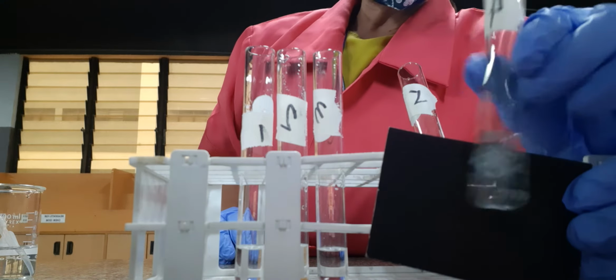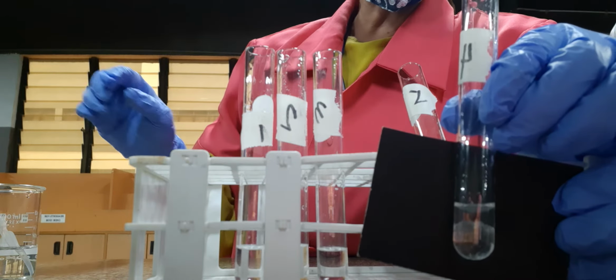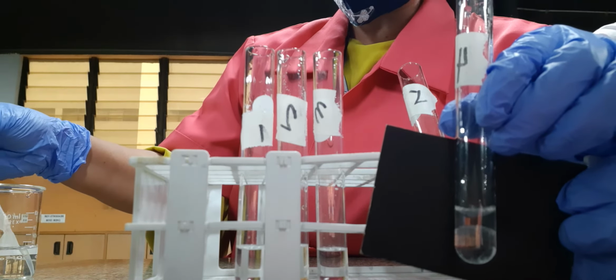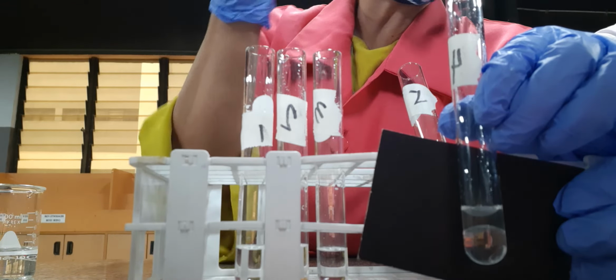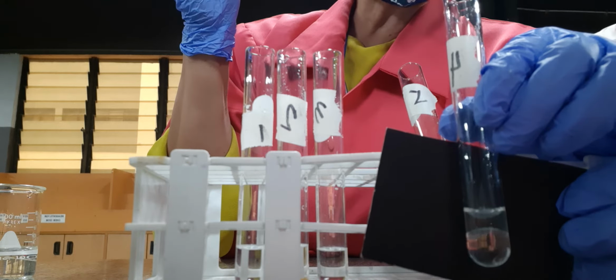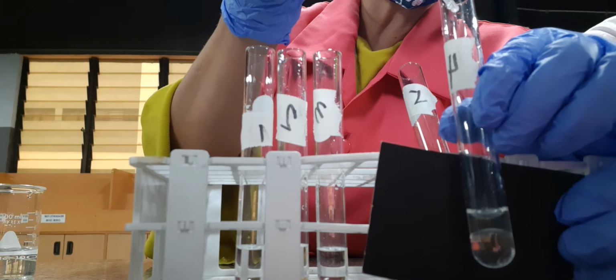Since they have the same volume, let us try to determine by adding more water. The more volume will be water, so that you will determine which one will sink at the bottom and which one is on top.